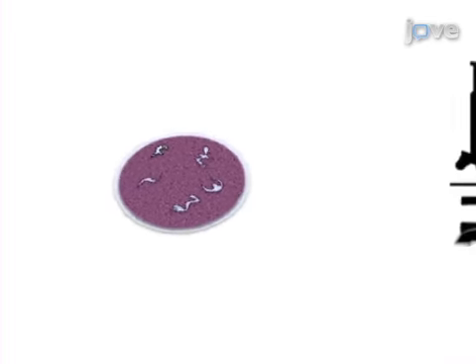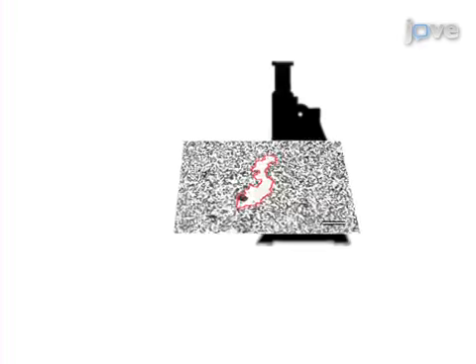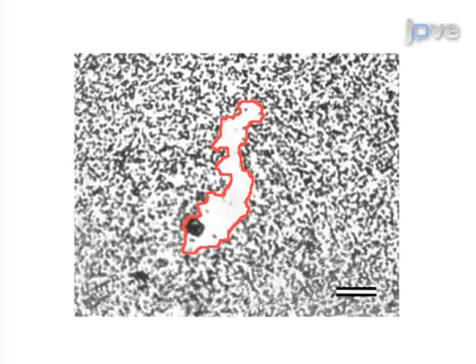The final step is the monitoring and quantitation of cell motility using microscopy to image the tracks created by the moving cells. Ultimately, area measurements of the tracks are performed using freely available software.